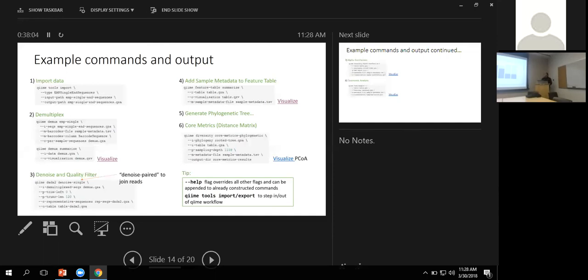So that's one way to look at the data after this step. And then the last tab here is the feature detail. So this is what I was talking about before. Instead of listing the OTUs, the way that they list the OTUs or features here is by assigning them another unique universal ID, so they can be tracked throughout the analysis uniquely. And then, you know, the frequency and the number of samples that it's observed in. So this isn't meant to be a tutorial, but just kind of showing you some of the different types of output that can be generated.